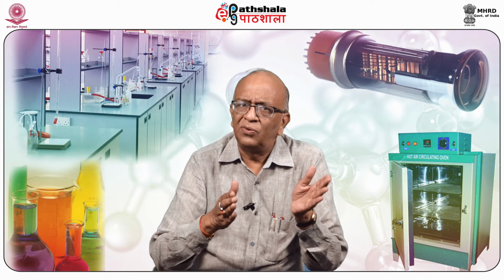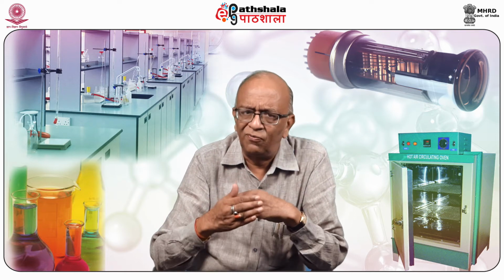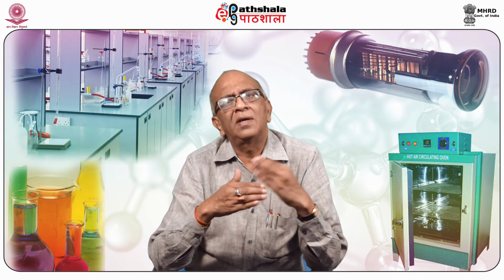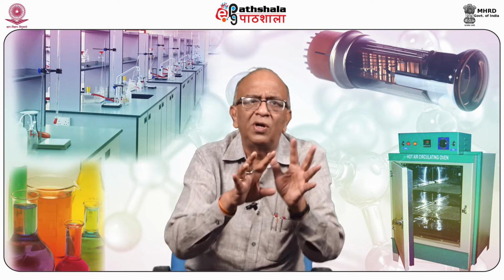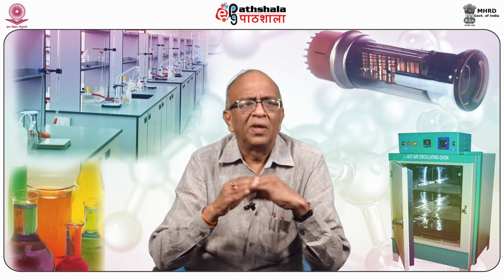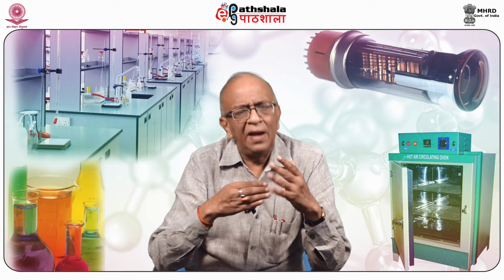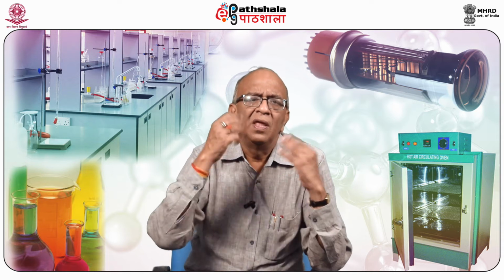In paper chromatography, we usually take chromatographic paper, whereas in thin layer chromatography, we take a glass plate or plastic plate coated with different types of support. It may be silica gel or alumina, and on that water vapors are held which function as the stationary phase.